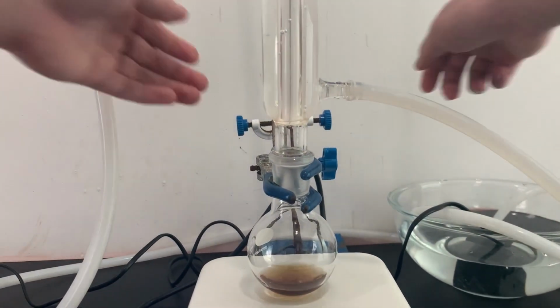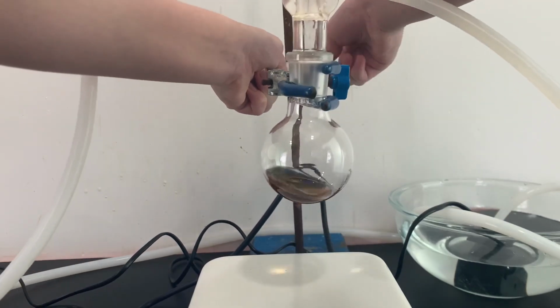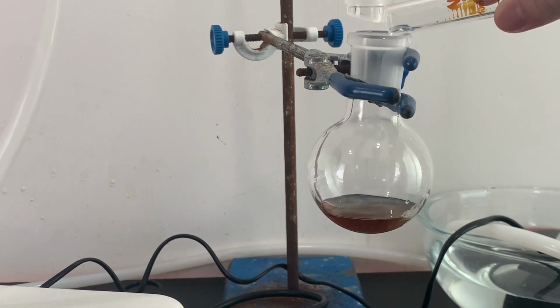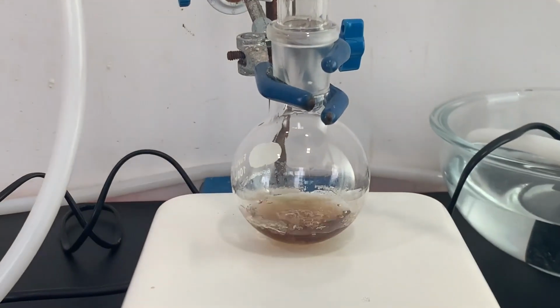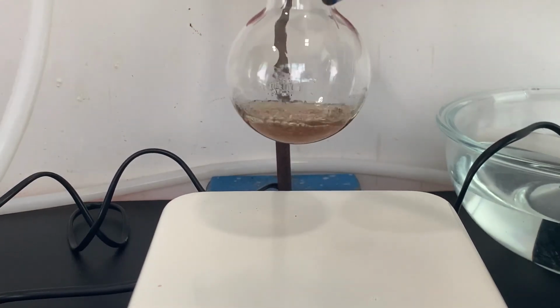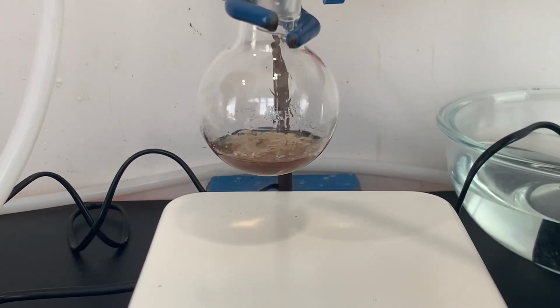After 10 minutes, I took the flask off the heat and let it cool down. Once it cooled back down to around 50 degrees Celsius, I added 3 milliliters of water. After adding the water, I placed it back on the hot plate and heated it until it started to boil. I took it off the hot plate when it started to boil. I then let the flask cool down in the freezer overnight.